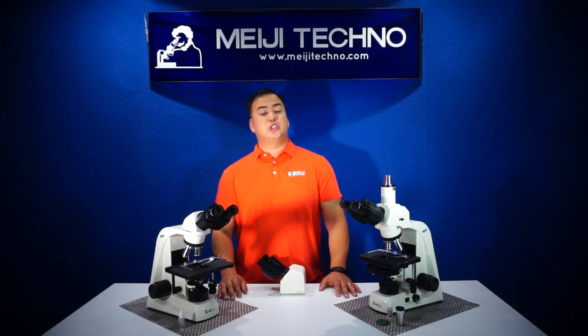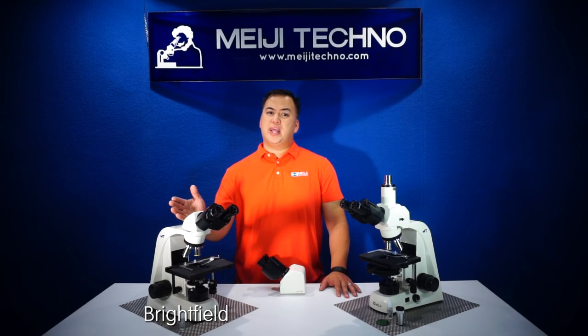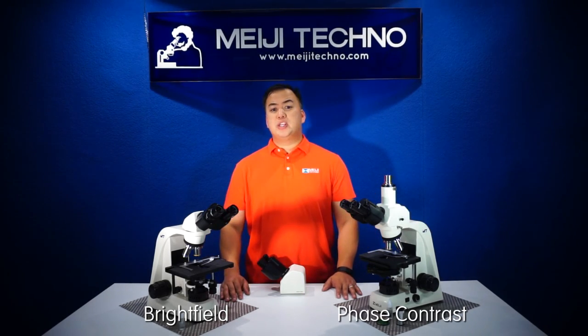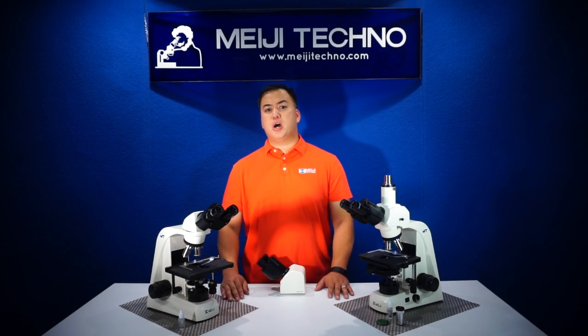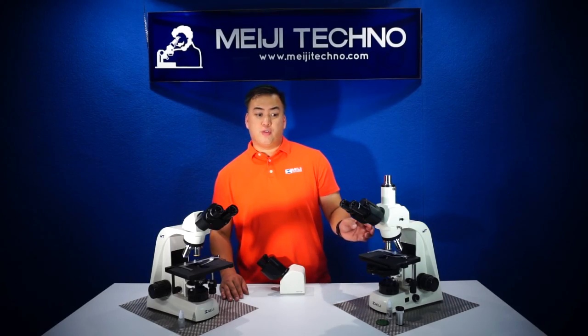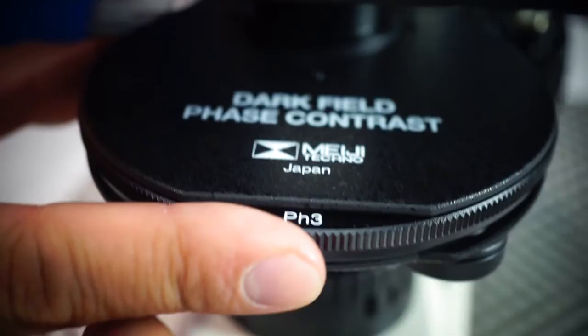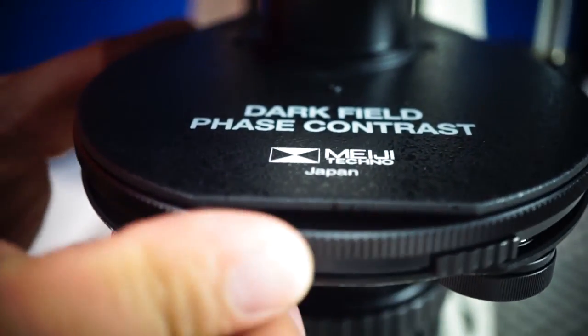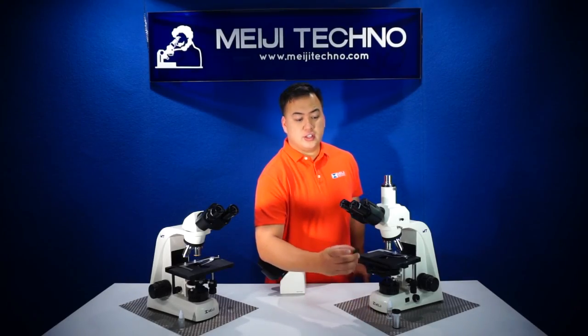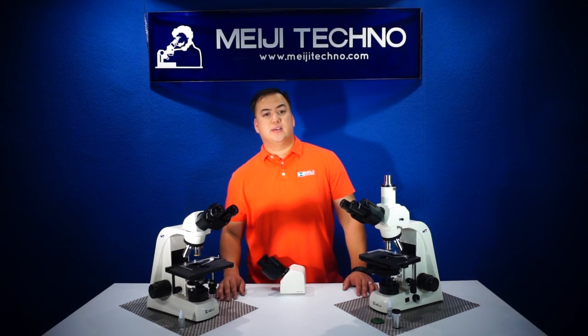The MT4000 comes in two different models: the brightfield model, as you see here on my right, and the phase contrast model. Both come with the mentioned features, but the phase contrast model includes a brightfield 4X and phase 10X and 40X objectives, as well as a phase condenser, a centering telescope, green interference filter, and immersion oil for oil objectives.